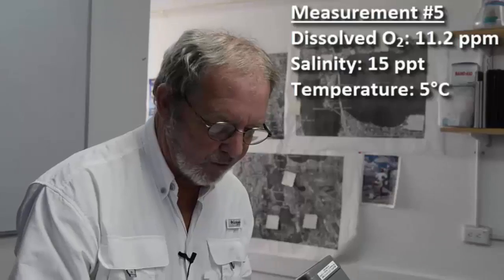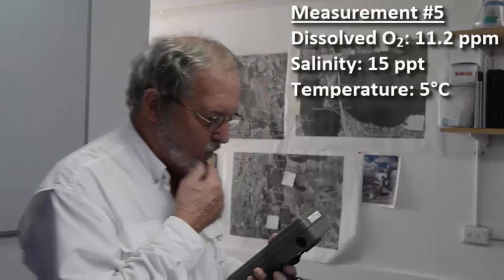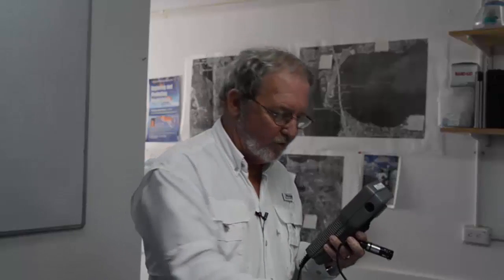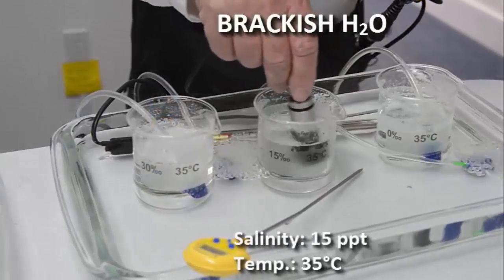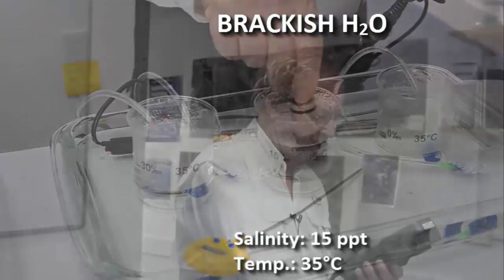Now for our last determination here we're going to look at again brackish water, 15 parts per thousand salinity, and in 35 degrees centigrade warm water. This would be our bath water. 5.7 parts per million dissolved oxygen.